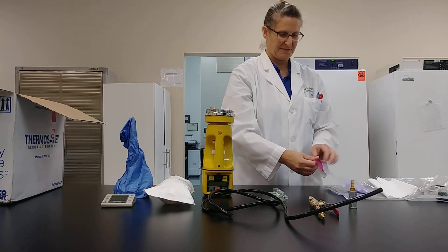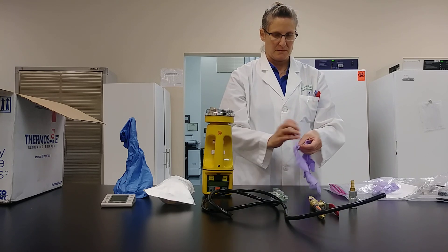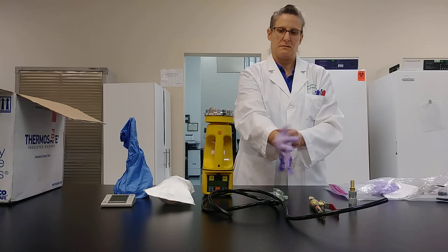As well as a quick connect piece if that's necessary for your testing. Be sure to handle your samples aseptically.